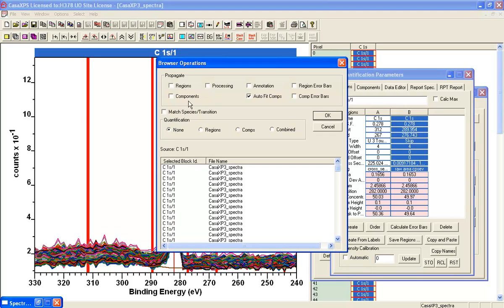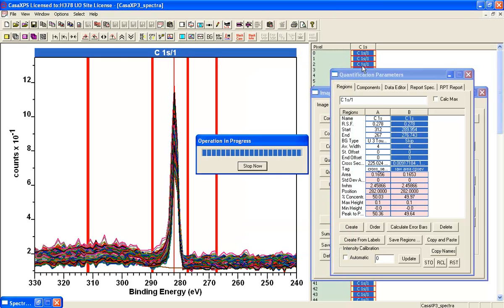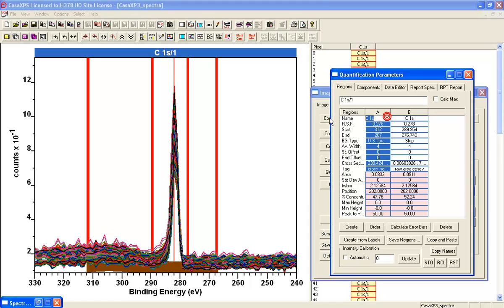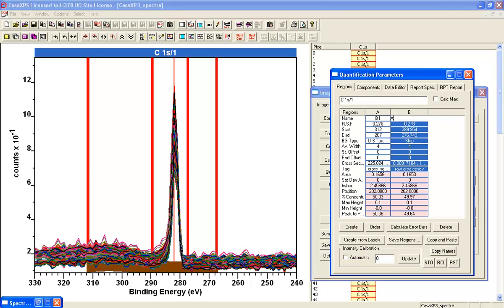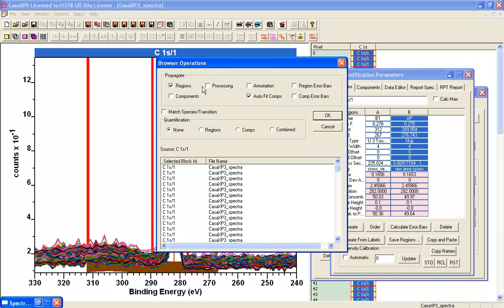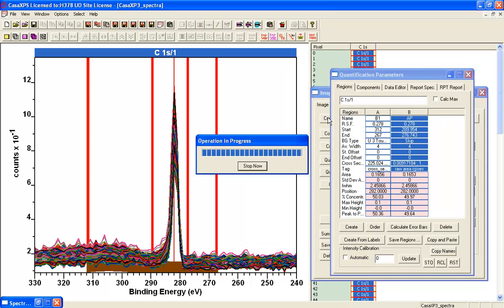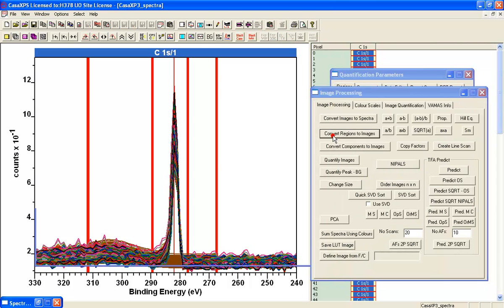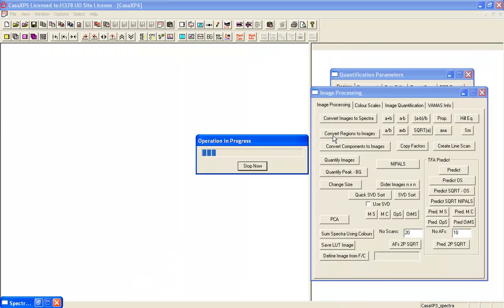and I'm going to propagate that to all of these carbon 1s VAMAS blocks. And I want to make this very specific, that we're going to call this one B1. This was AP. I'll propagate and then calculate the images.